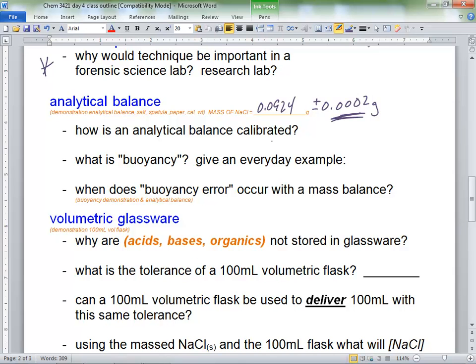Does it have to be oriented like this, or does it have to be oriented like this? Because they are two totally different numbers, right? Which one is the true zero? Is the true zero this one? Or is the true zero the one where, Shelby, help me out? The answer is buoyancy. The true zero is this one, where it's set up, because it needs to have the exact same density it had before.